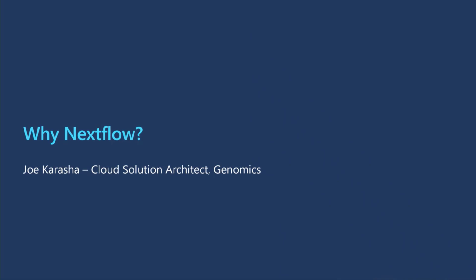Nextflow separates the workflow definition from its execution, which makes it possible for you to define your workflow in one environment and to run it in different environments, whether you're running this locally on your VM or your desktop, running it on your local on-prem compute cluster, or running this on the cloud.